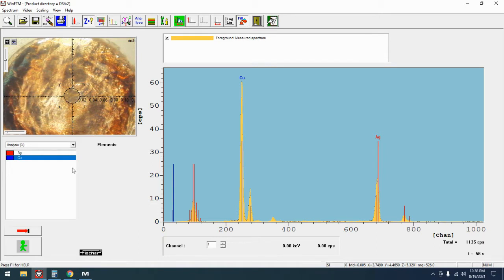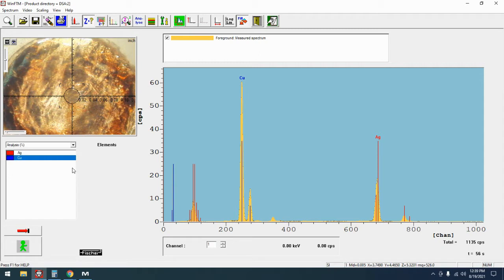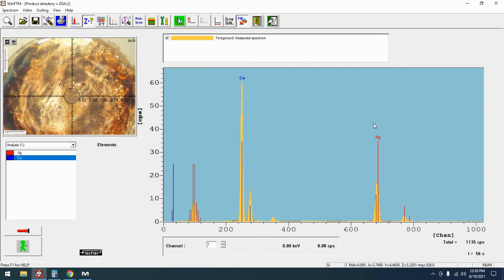So what the reference measurement does is it takes two long measurements on two different saturated elements, one of those being silver and one being copper. The reason why these two elements are used is because as you can see from this spectrum they're the farthest out on the spectrum.